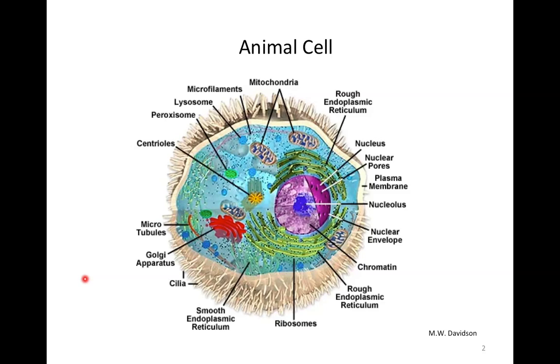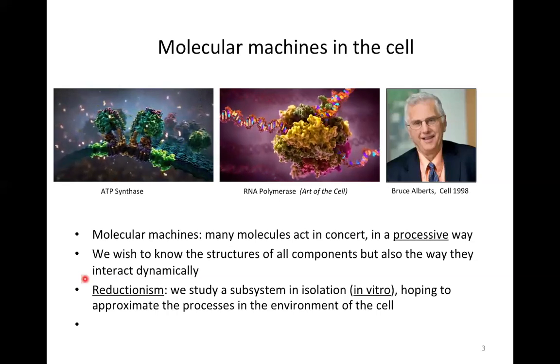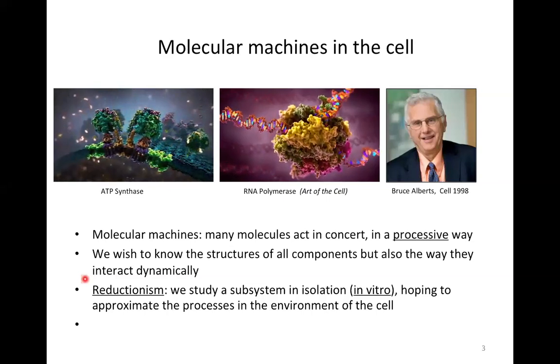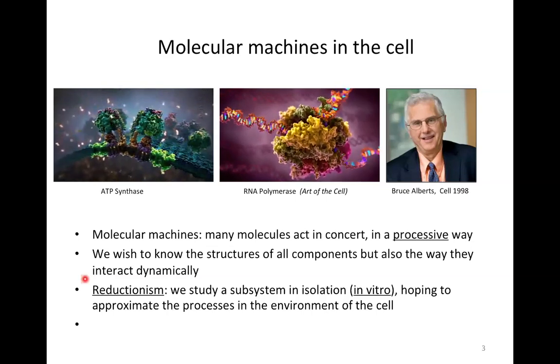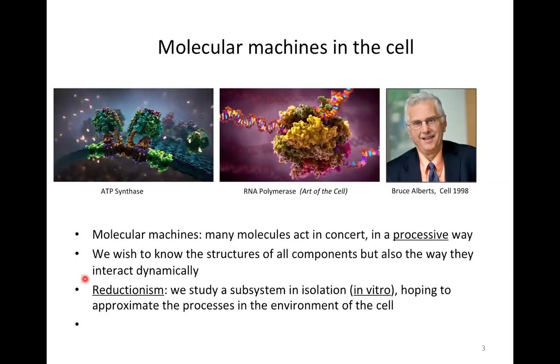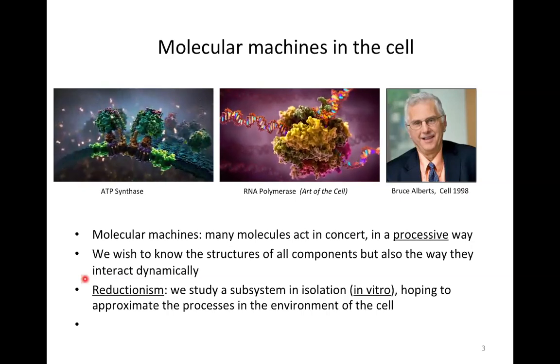And so what we do is we exercise reductionism. We essentially take molecules and their interacting partners out of the context of the cell into an in vitro system. Now, this is a gross simplification, but it is the only way how we can do this.